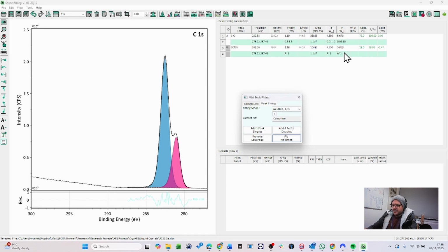We can add a modifier using the hash key. If we do a times 1 hash, say 10, that's going to give us about a 10% margin of error. So if we click fit again, you'll now see that this has gone back to the original line shape parameters because we've given it that grace, that margin of error, about 10%, and that'll allow this model to primarily focus on fitting the data rather than on being a more physically realistic fit.